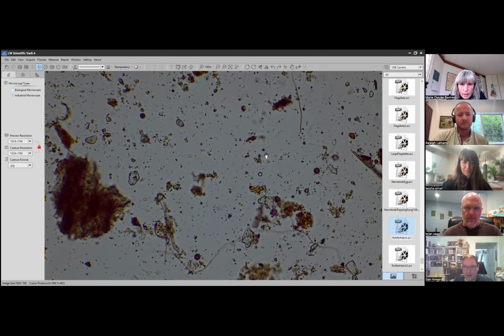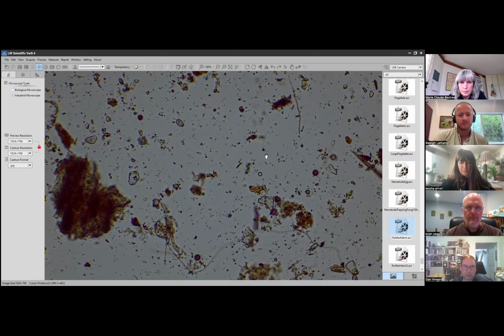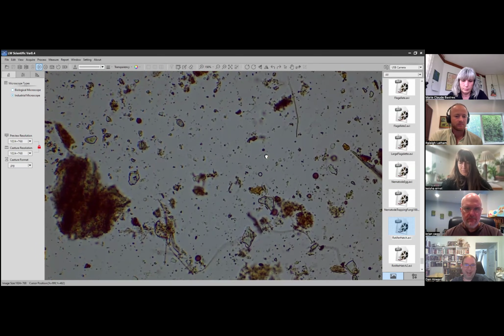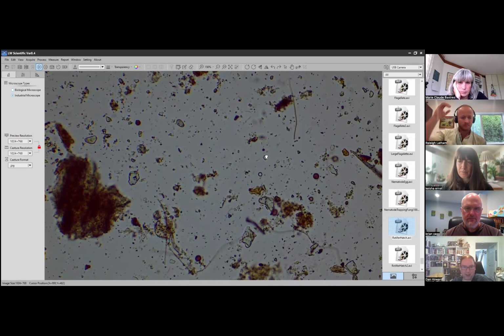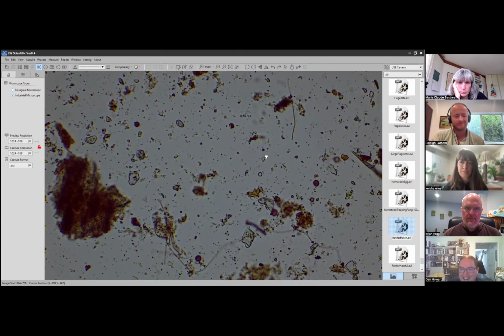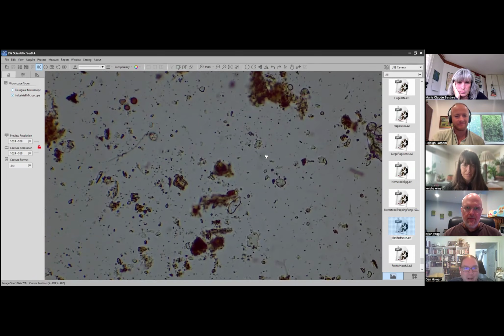So yeah, it's a 1 to 10 dilution. This is compost that I made in the spring into summer, where it's been sitting combined in a mother pile right now. I just took a sample yesterday. It's under just under a foot of snow, so it's been thawed out a little bit, but yeah, this is the sample here.